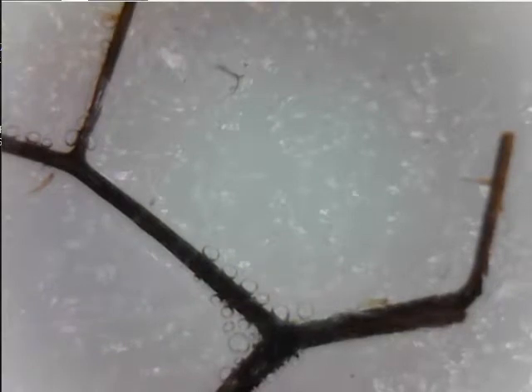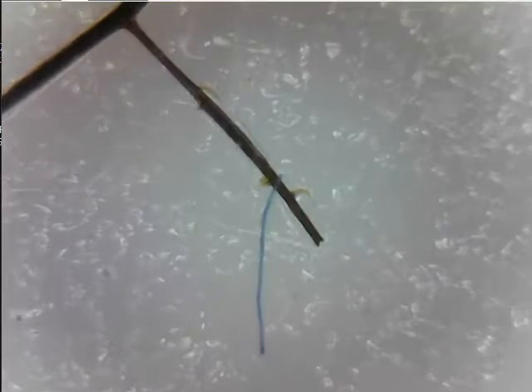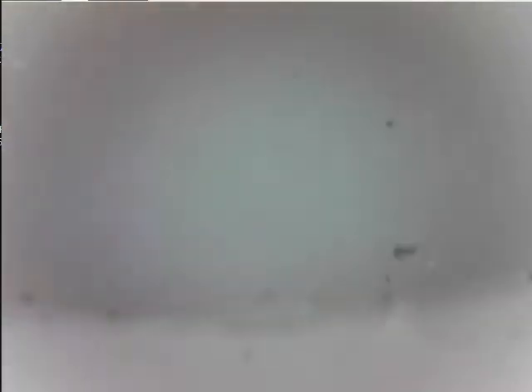As, like, remember the fruit fly, the spiders, the one grasshopper I looked at I believe, the cricket I looked at that was covered in mold. They all have that look. Yet anytime I've encountered something like this, either it's been something I put there separately, or it came off way too easily for it to be attached. I'm leaning towards contamination.